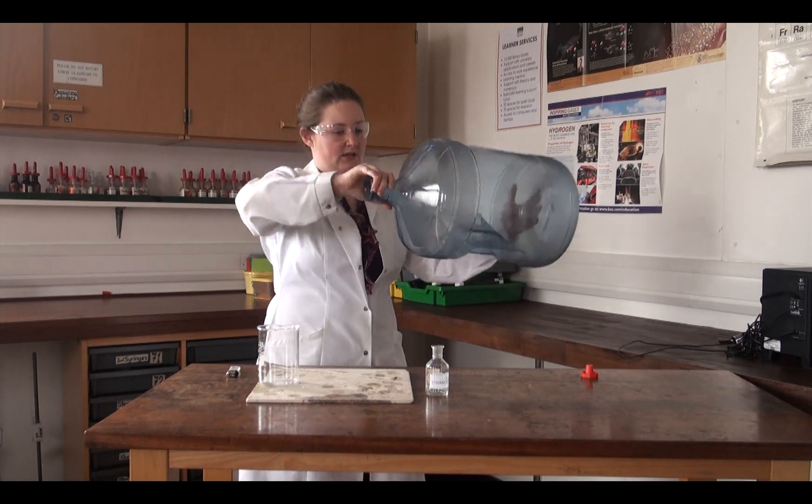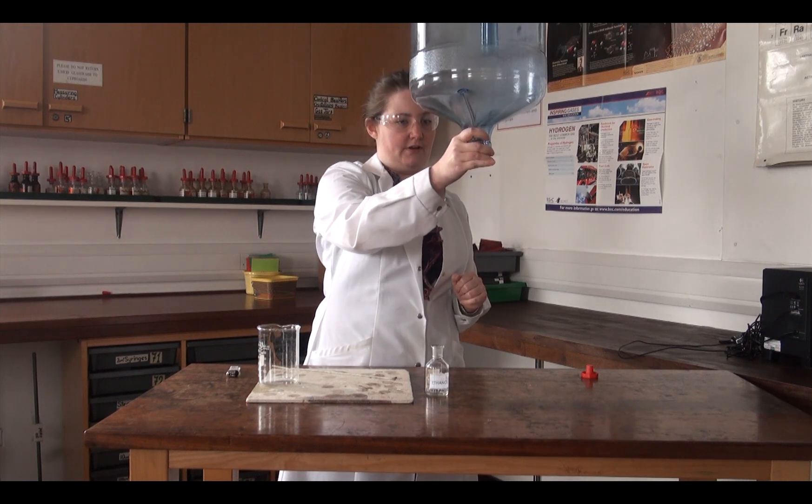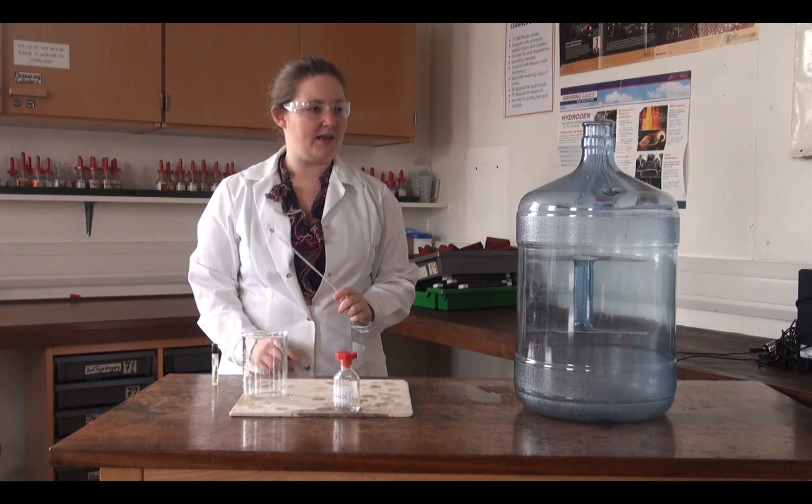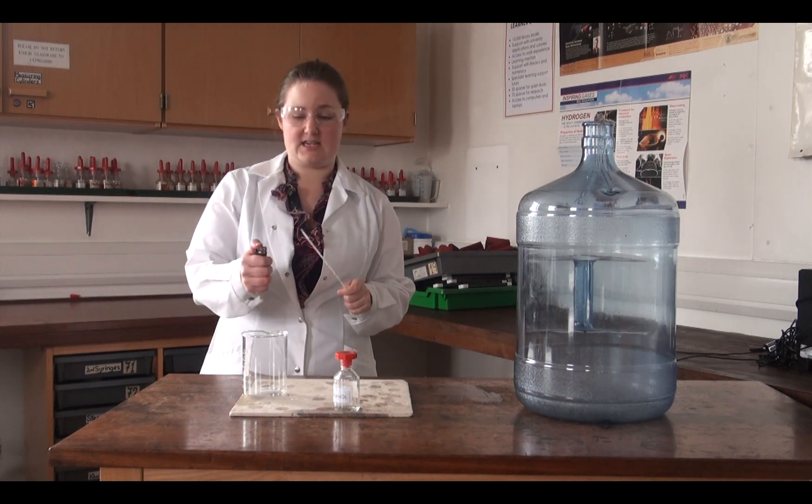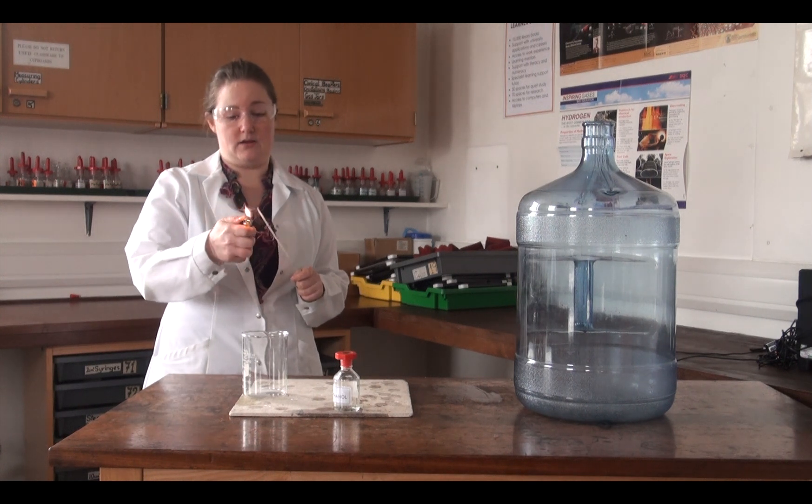There should be now very, very little left in. So now, at arm's length, using a taper, I'm going to light the taper and light the vapor inside the bottle.